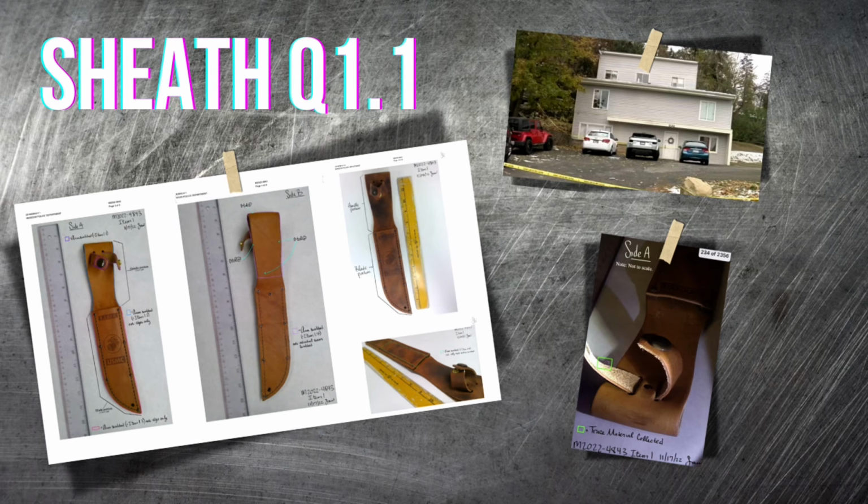This is why independent review matters. Someone outside the originating lab needs to be able to trace a single item, like Q1.1, from collection through every plate and STR mix run, without getting lost in the lookalike labels. This correction is my own misreading of the specific Q1.1. The larger point is still the same.